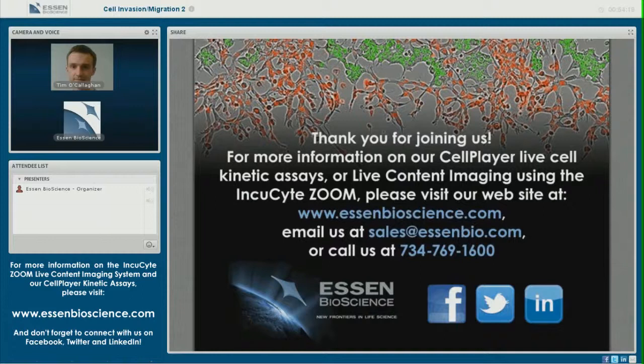Of course, we're very aware of the need to understand chemotaxis and being able to resolve chemotaxis from chemokinesis and also haptotaxis, for example. So these are things that we're very, very aware of, but we are unable to address with this model of migration at the moment. So I hope that's answered your questions, but please keep in contact, and that's a wonderful question to ask.